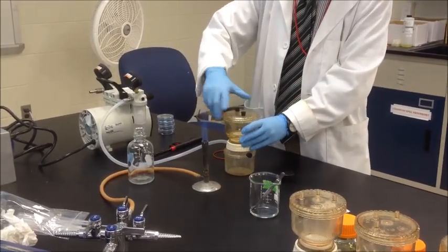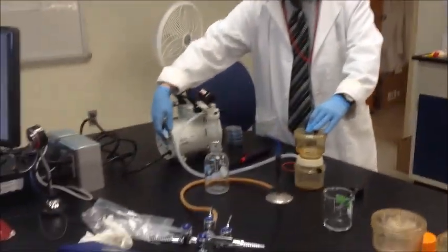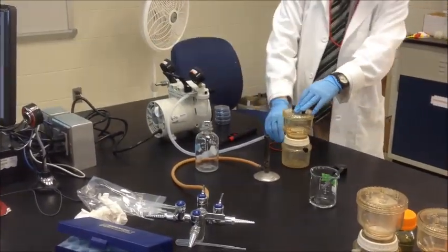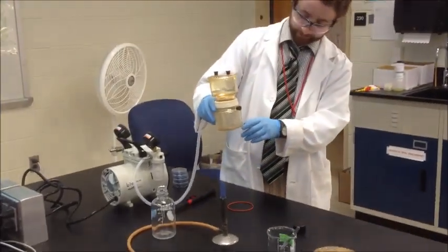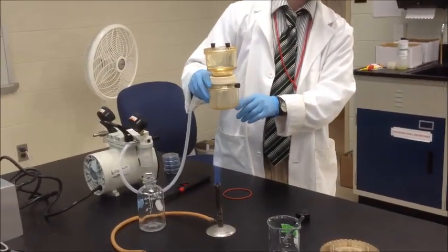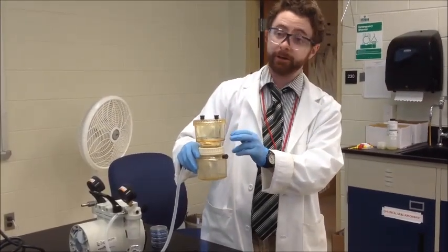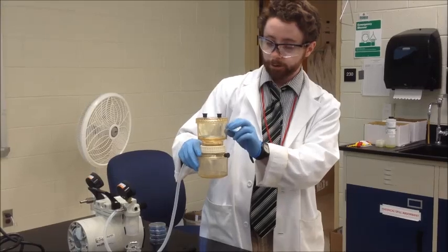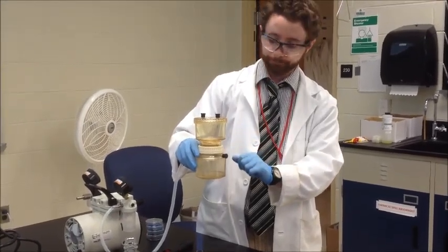We close it, and then I turn on my vacuum. What you should start seeing is some of the water now coming through. Any bacteria that would be present, in this case there won't be any because this is sterile, will be caught on that membrane that I placed in the chamber.